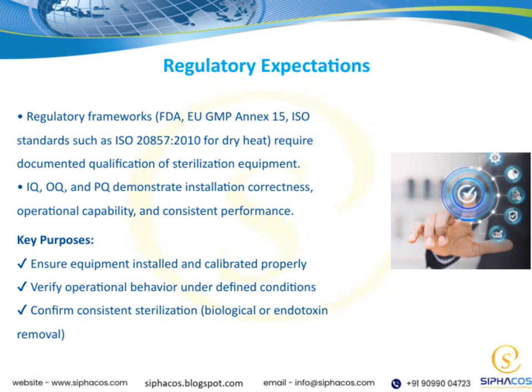The main goal here is to ensure that the sterilization process is reliable and effective. We want to be confident that the equipment is installed and functioning correctly, that it behaves predictably during operation, and that it consistently achieves the desired sterilization outcomes. All of this ties back to our overall theme of maintaining quality and compliance in sterilization processes.